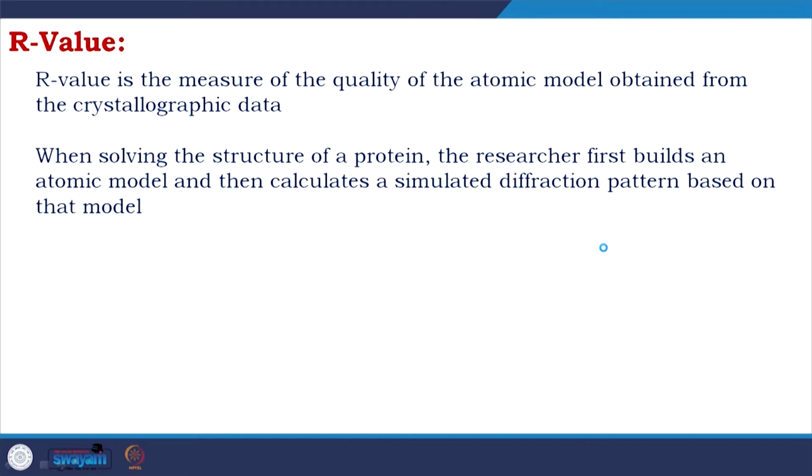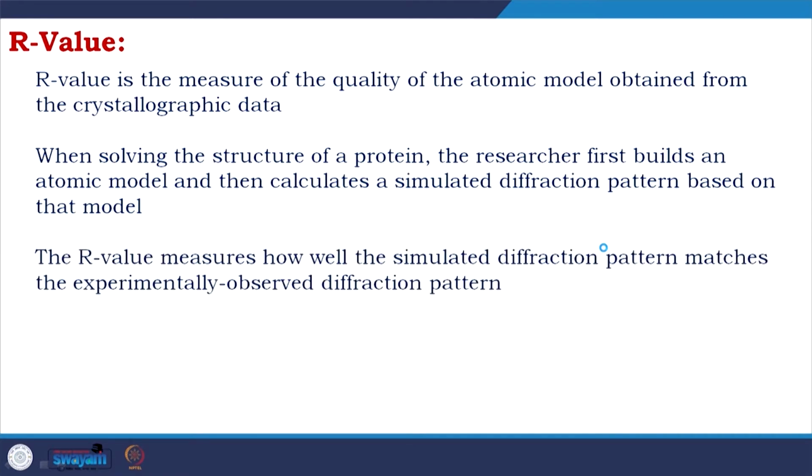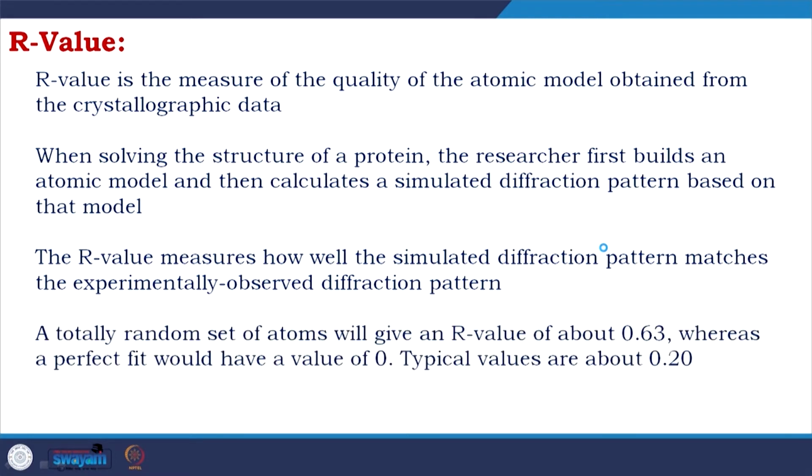So, you know the diffraction happened, now you make a simulated diffraction pattern. The R value measures how well the simulated diffraction pattern matches the experimentally observed diffraction pattern. In one you are using the model to make a simulation, in the other you are using the actual data, and you compare between them. That is R.